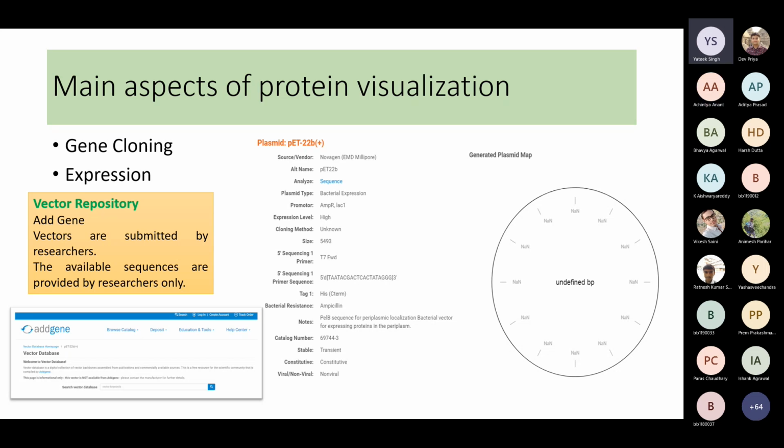That is what I said in the introduction. Nowadays, before that, people had to do a lot of trial and error and experiments in order to clone a gene. Now things have advanced and we have the in silico platform. So whenever you clone a gene, or whenever you want to express a gene in E. coli or any organism, first you take it as a project.